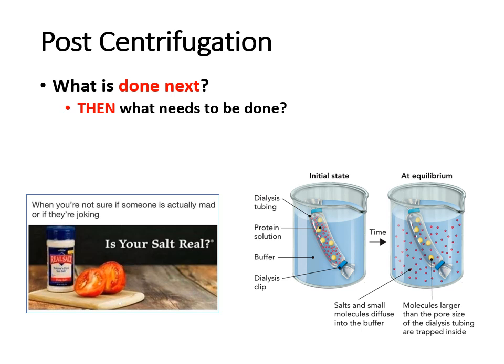Now, once you have used the ammonium sulfate to salt out your target protein, the problem is you're not going to want to use that protein in experiments while it still has the ammonium sulfate. So the next step that you would do is dialysis in order to remove the ammonium sulfate.